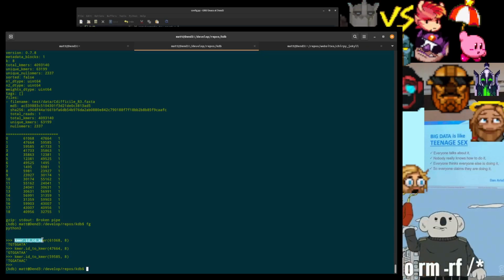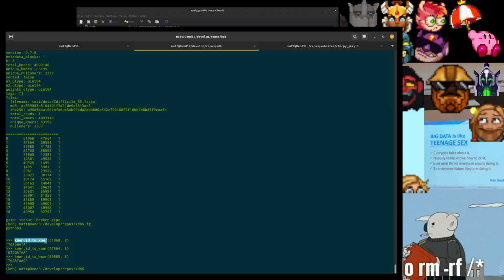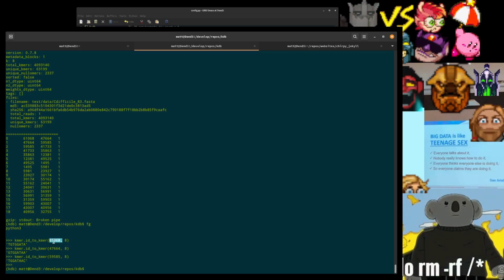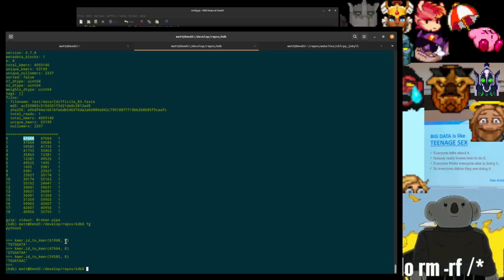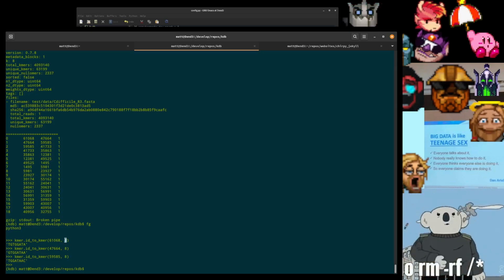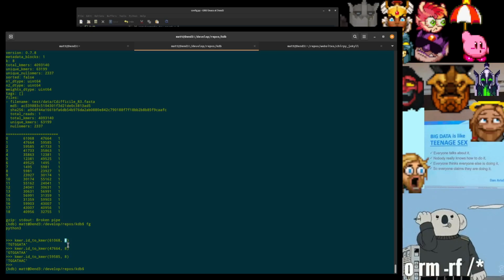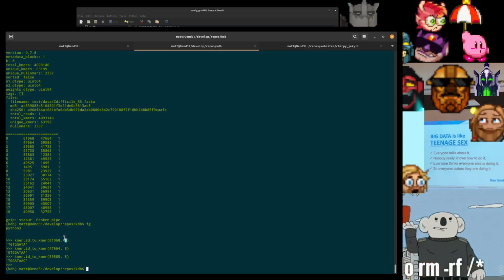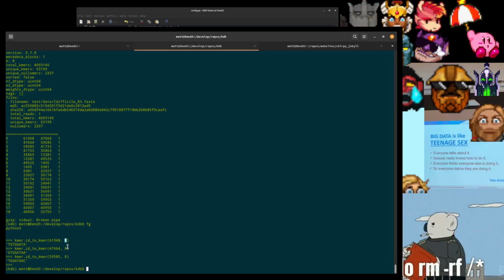and I've recently patched the ID to kmer and kmer to ID functions. Here I am adding in that 61068 ID and then explaining to this function that the choice of k has been 8, because 61068 would identify a different kmer under a different choice of k.